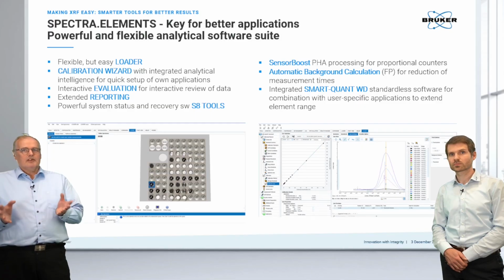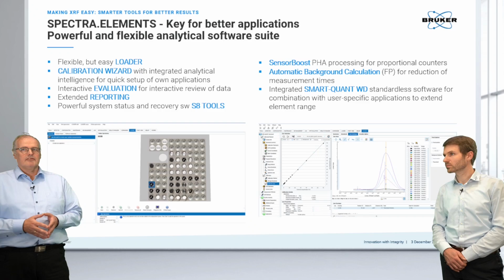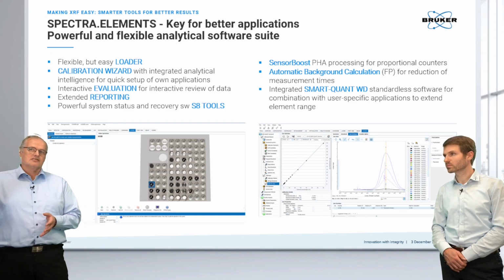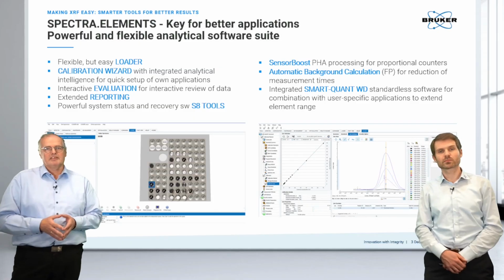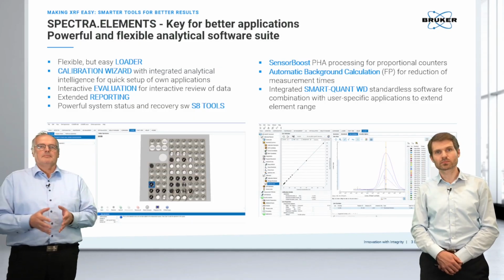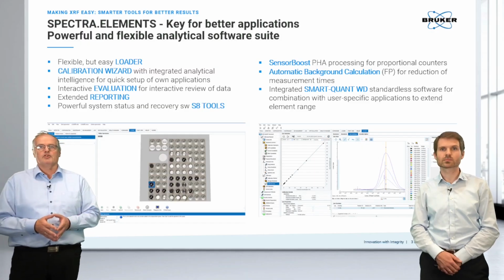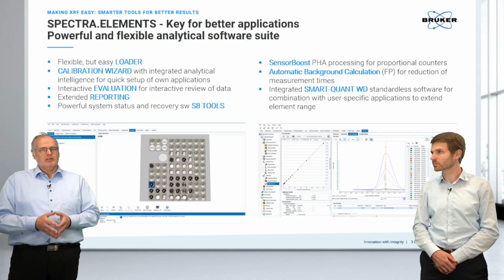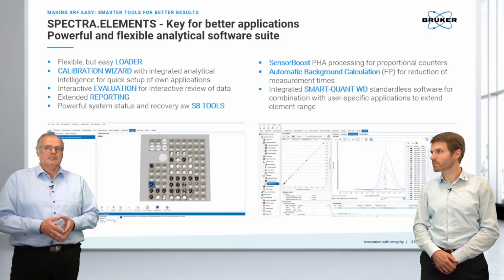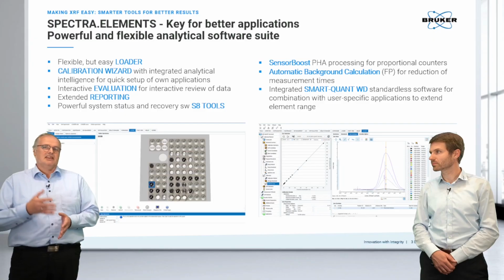Within those software packages there are functionalities we have newly invented. For example, the so-called Sensor Boost, and it actually does what it says. It boosts up the linear count rate of the flow counter or proportional counters. And then we thought, you can do a lot with fundamental parameters for concentration evaluations, but is there anything more?